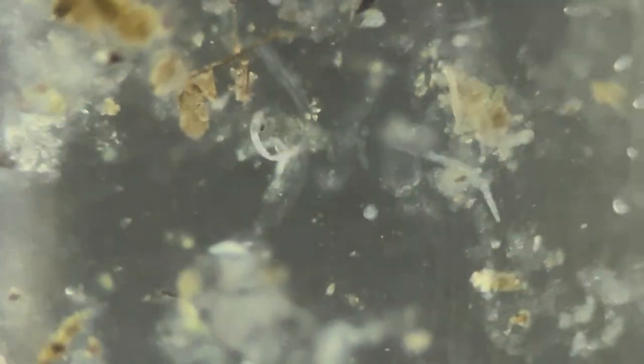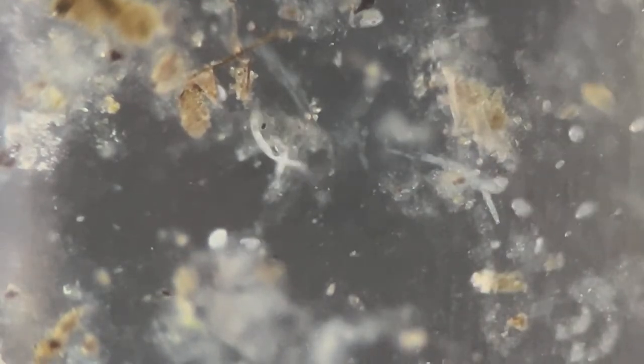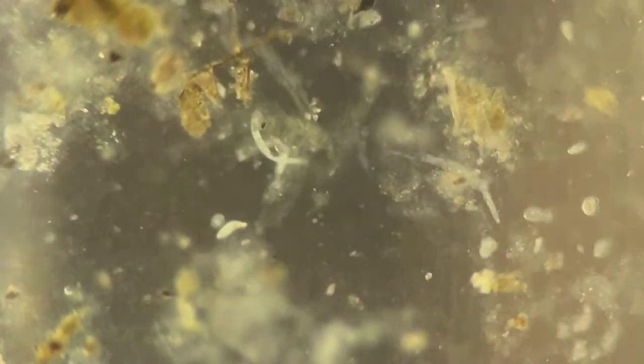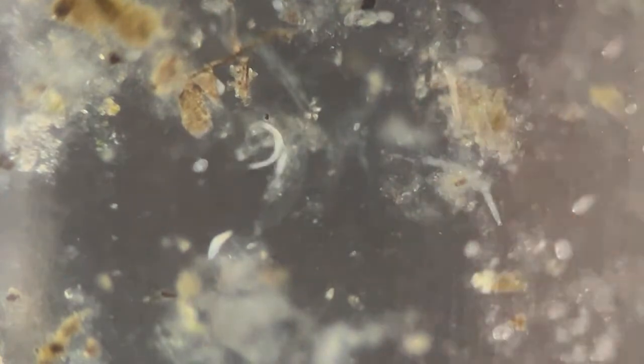All right, I've just realized one more thing. This is an improvement. Okay, I'll explain later what I've realized. You see this light system, this reddishness in the side, the pinkish reflection?